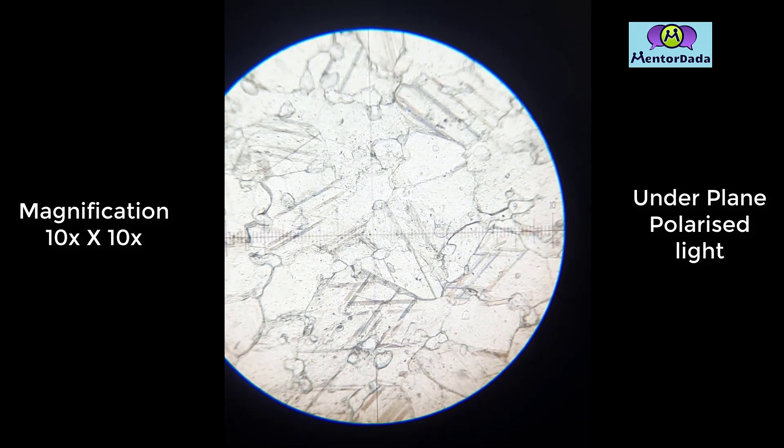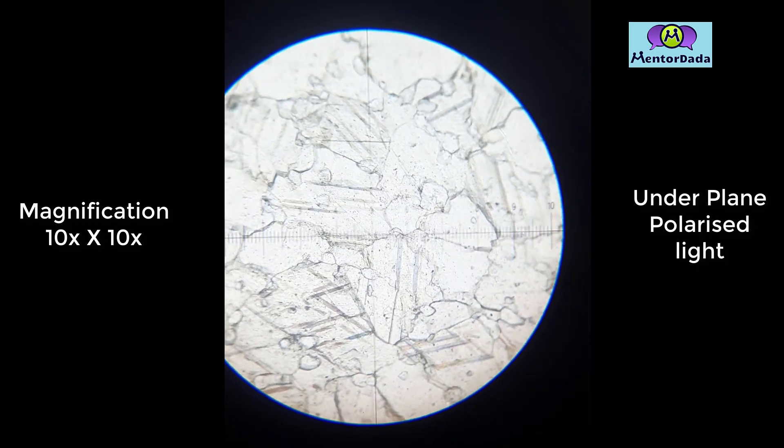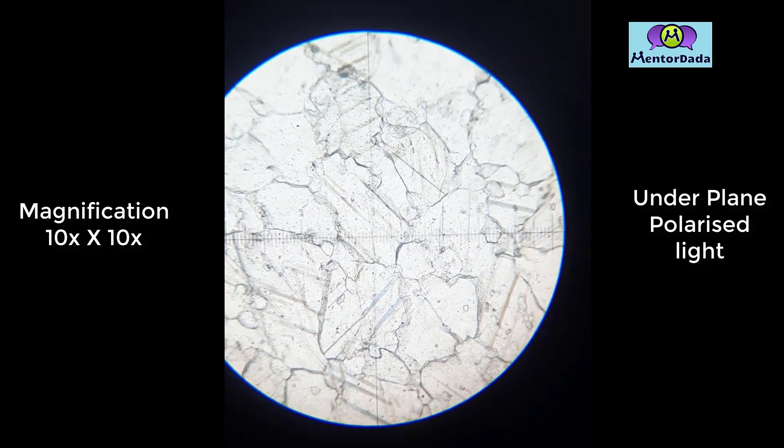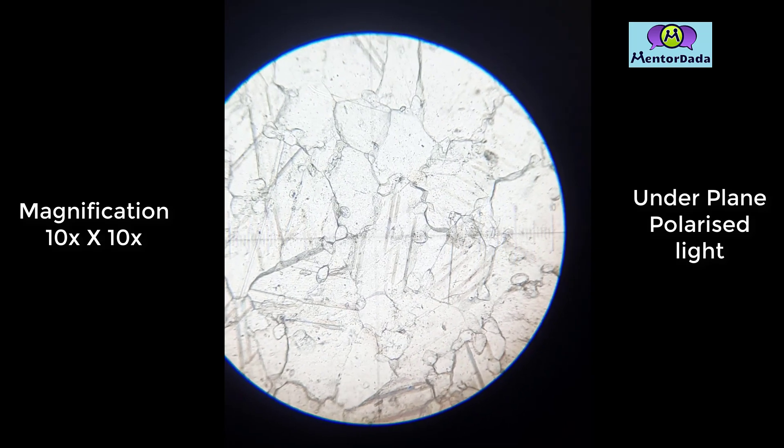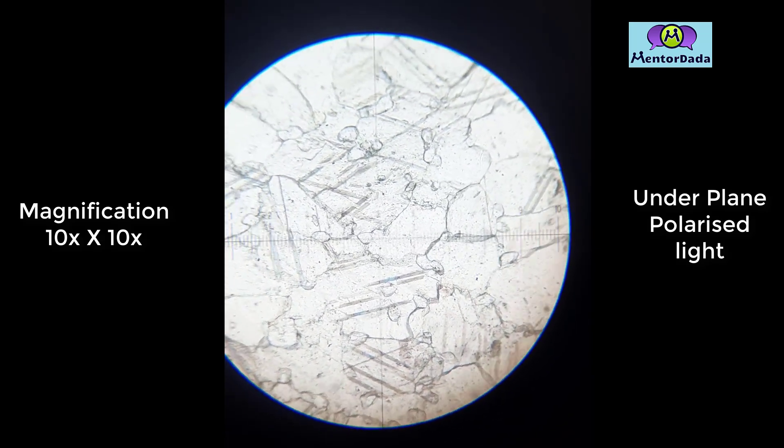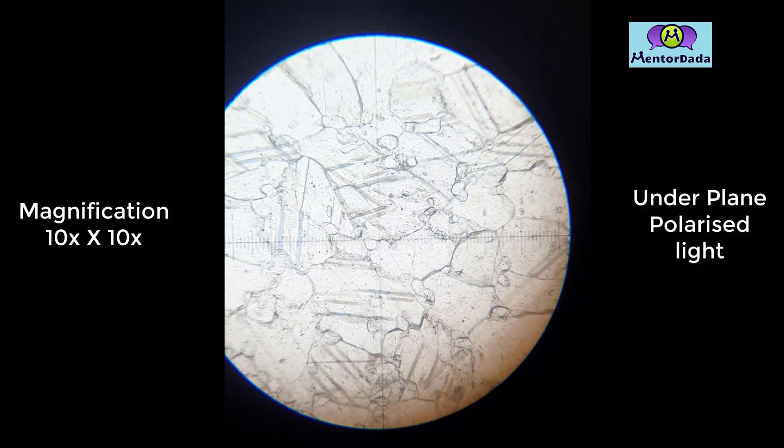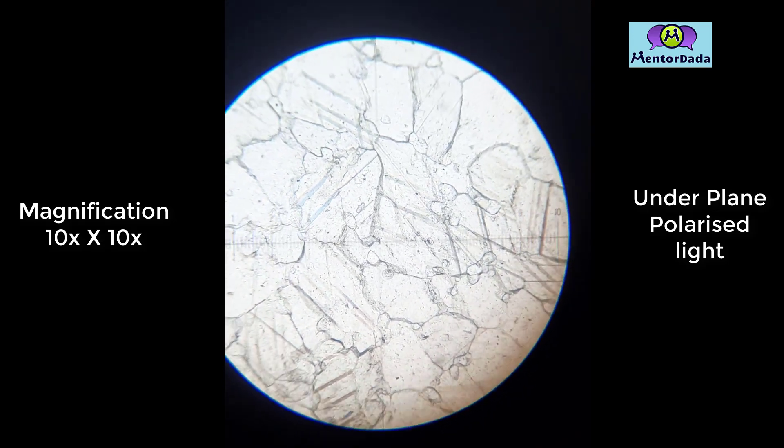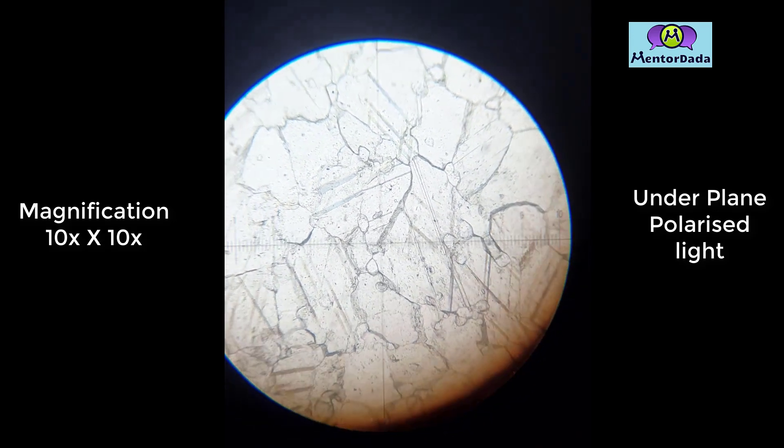Now, the outline of the mineral is low to medium. The surface of the mineral is moderately smooth. The moderate to high RI can be seen. Two sets of cleavage can be seen here.